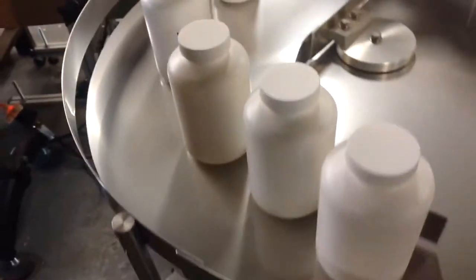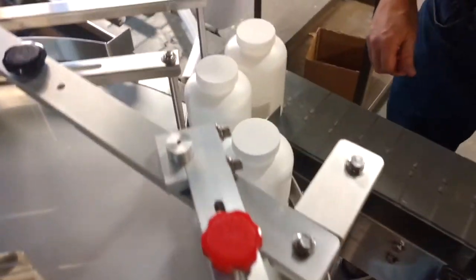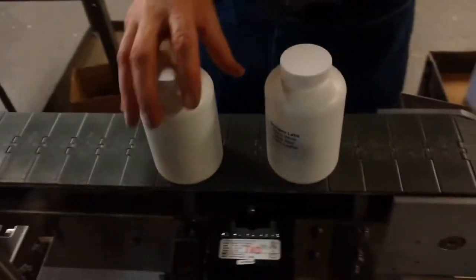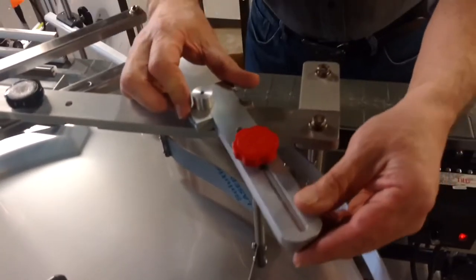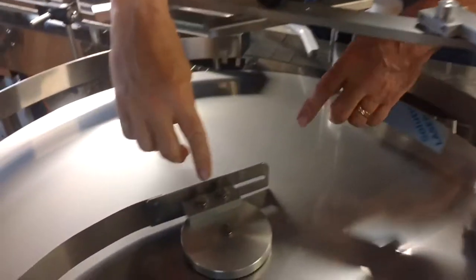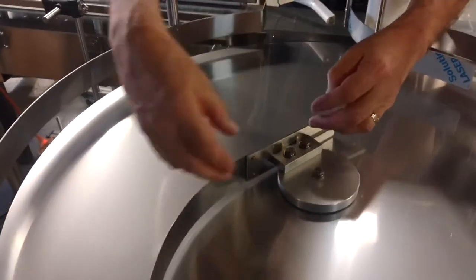I'll pick this one and open up the key. This one you can adjust this way, this way, all kinds of ways — block it off, stuff like that depending on the bottle size. This adjusts in and out to bring the guards; keep the bottles out to the outside, all the way in for the large bottles, move it out for the small bottles.